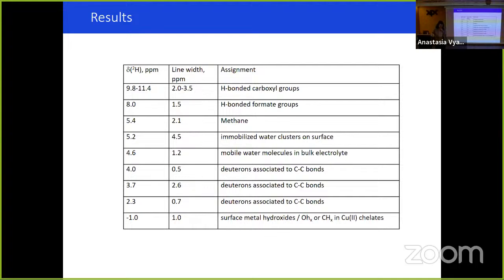The second additional answer is that it allows not only studies of the liquid component, the electrolyte, but also the surface itself. I can't show it here, but we also measured copper spectra. So we can measure one after another at a certain voltage parameter, and it was quite interesting to observe both. So this enables us to measure the reaction container at the surface, the catalysis surface.